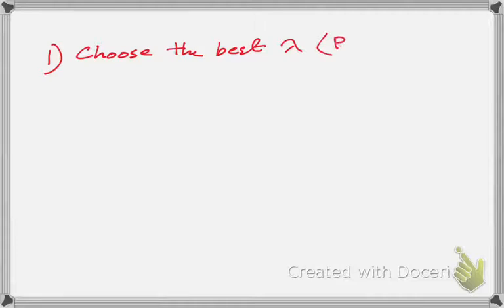In part 1, we discussed how to choose the best wavelength for both the red dye and the yellow dye.